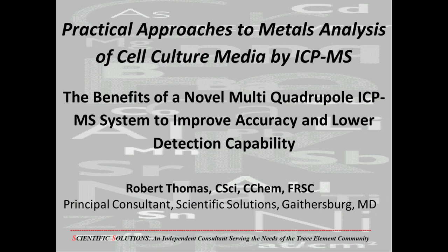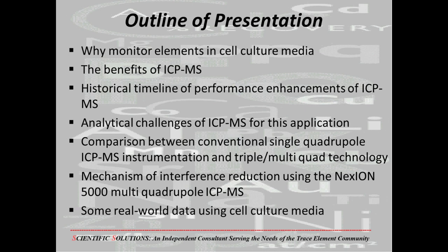Before we get started, we do have one question for you that will help our speakers. You're going to see that on your screen, and if you could just use your mouse to select the answer that works best for you. The question is, do you currently monitor the elemental composition of your cell culture media? Yes, I use ICP-MS. Yes, I use ICP-OES. Yes, I use a technique other than ICP-MS or ICP-OES, or no, I don't monitor. So again, if you can just take your mouse and select the answer that best works for you, that will help our speakers.